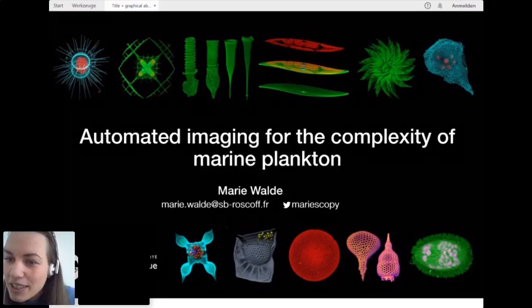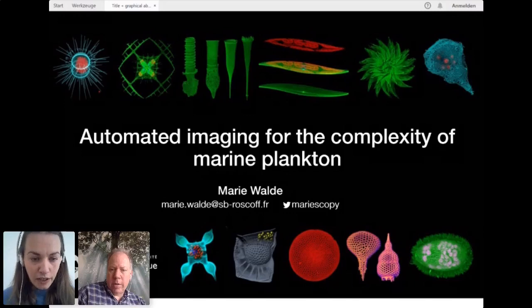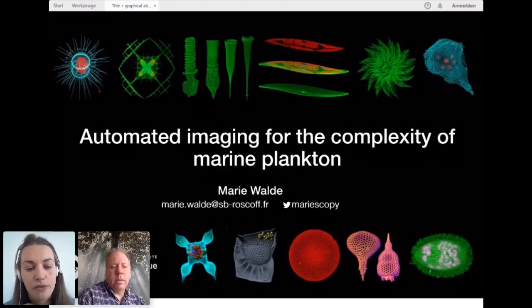Someone's also suggested a related one: can you see microplastics pollution in the water at the same time? That's not what we're filtering for. But there are abiotic structures that are usually just thrown out. If somebody wanted to look specifically for microplastic, there's a surface staining based on PLL that allows us to see the surface structure of many cells. And then microplastic probably wouldn't have any nucleus, any chlorophyll.